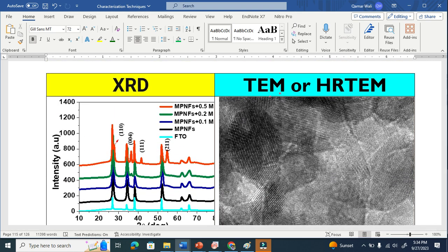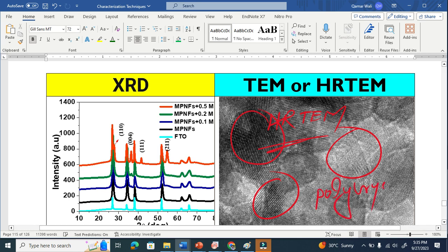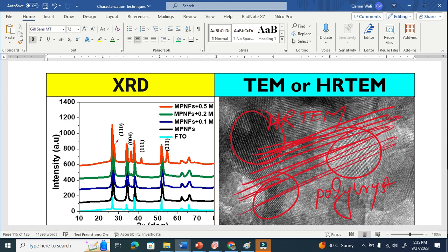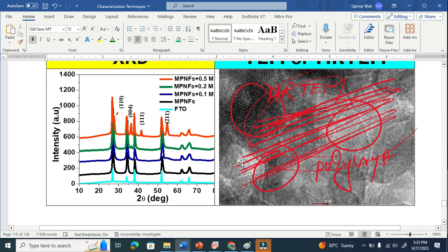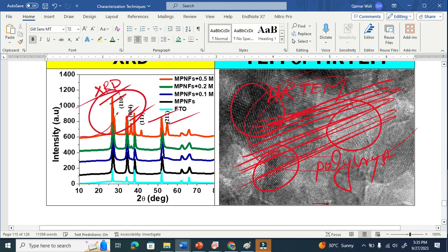Looking at a high-resolution TEM image, we can clearly see this is a polycrystalline material — one grain here, another grain here, another grain here. If it were a single crystal, we would see only one grain filling the entire area. This is polycrystalline. Correspondingly, in the XRD pattern we see multiple peaks — one peak, another peak, another peak. If it were single crystalline, we would have only one peak.